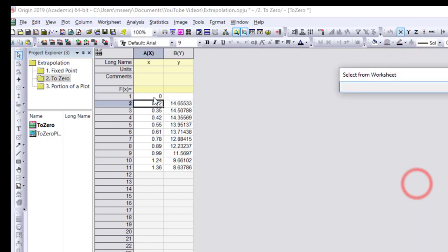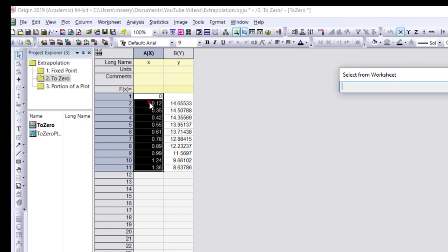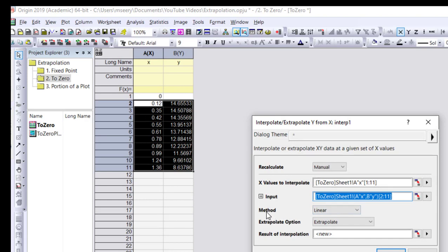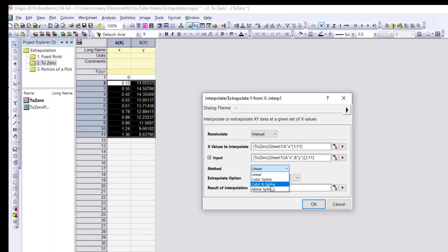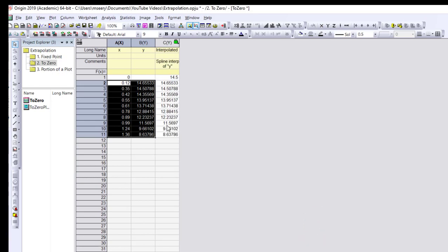Select the x values including the zero point we want to find, and the input data is the known XY plot excluding the unknown pair. For the method, since this is a curved plot we could choose linear as an approximation, but let's choose cubic spline to better represent the curve. The extrapolate option is selected again and 'New' adds a new column. You may need to check the goodness of fit, but for small differences the method choice is unlikely to make a big difference.